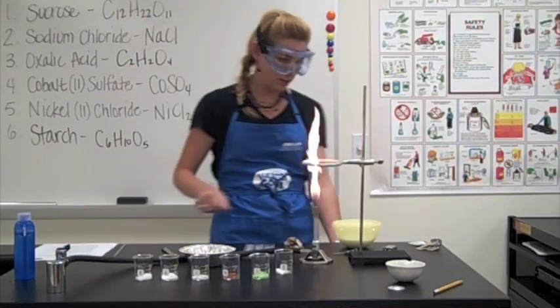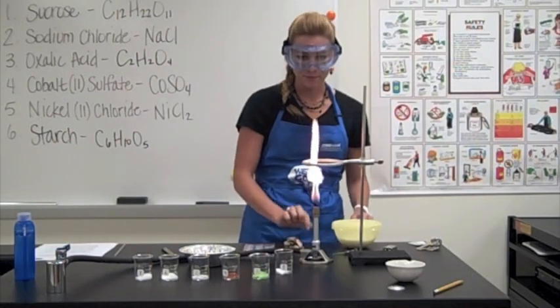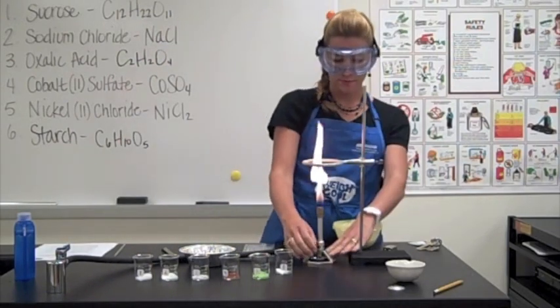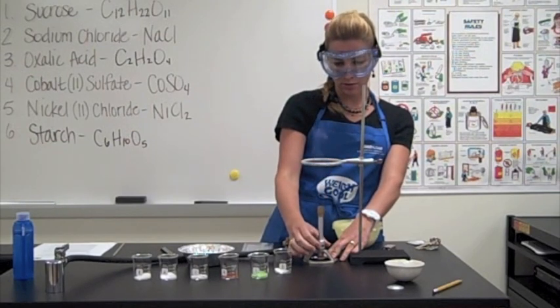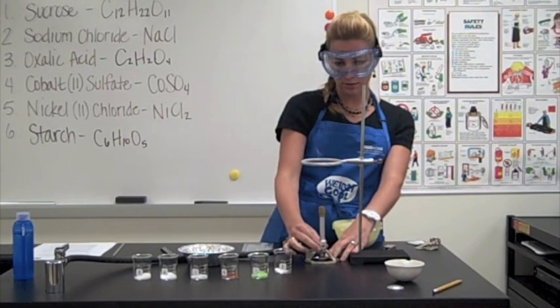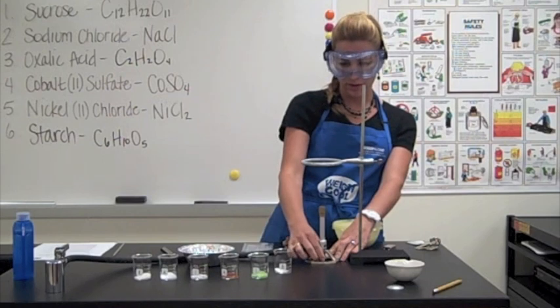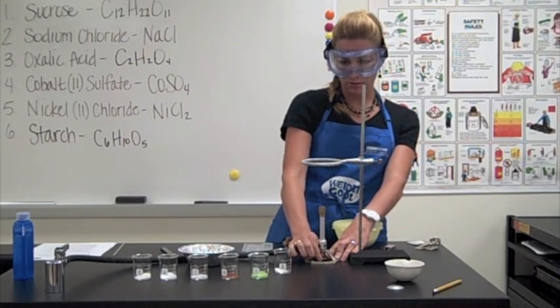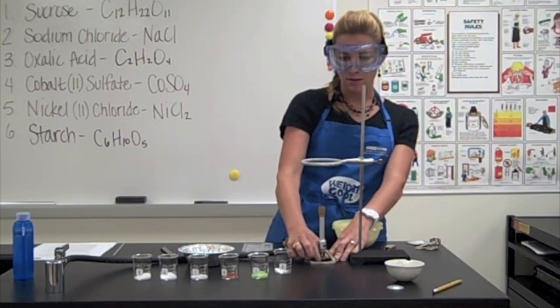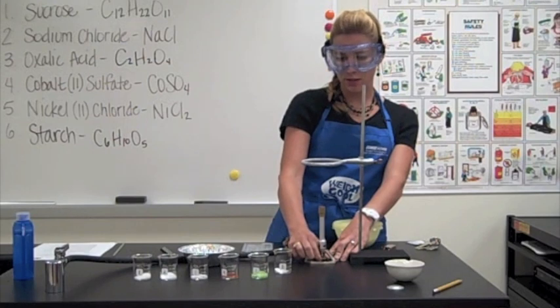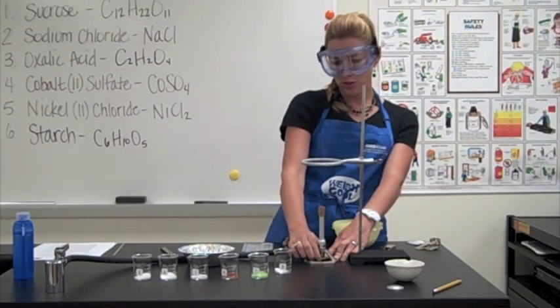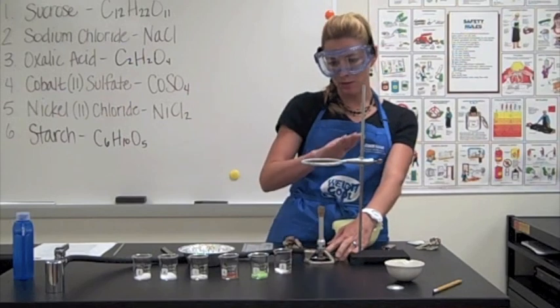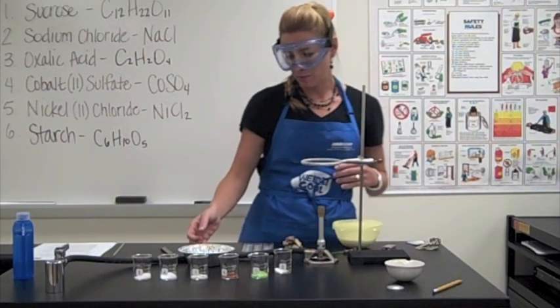And that is an ugly, nasty, grody yellow flame, which is exactly what we don't want. So the height of it is actually looking pretty good. I'm going to go ahead and turn the barrel until I just get the yellow part out of the flame. Actually, my flame is just a little bit tall. I don't need that strong inner blue cone flame. I just really want the tip of the flame kind of brushing the bottom of my plate.